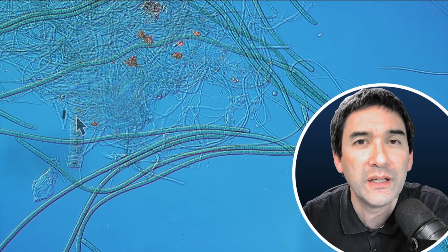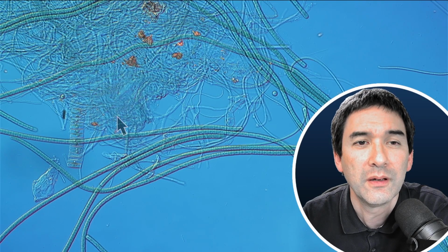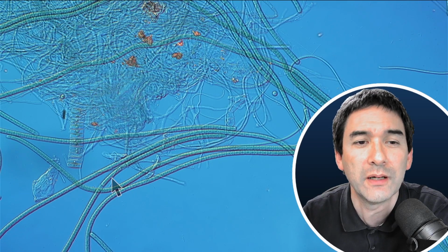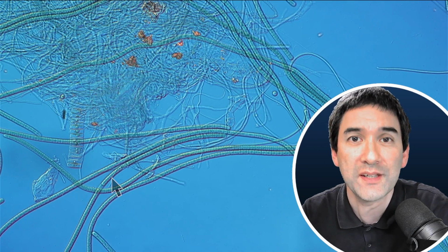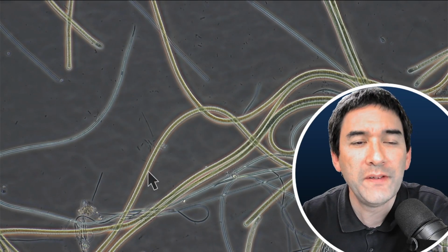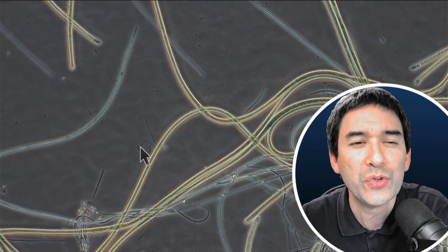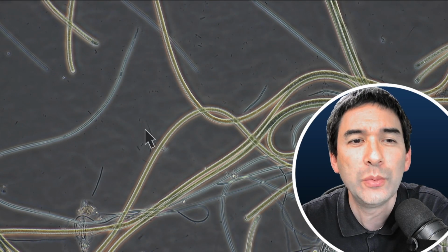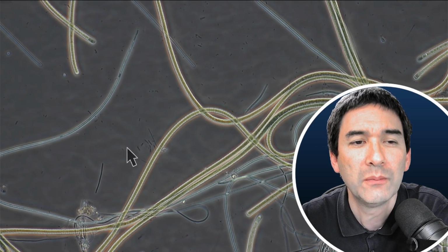So these are again eukaryotes, and the filamentous ones here are prokaryotes, the cyanobacteria. Now, I would like to show you how they look in phase contrast. So we now have phase contrast, but I would like to direct your attention to those darker rod-shaped structures that you see here between the cyanobacterial filaments. There are a few over here. Here is also maybe a longer one.